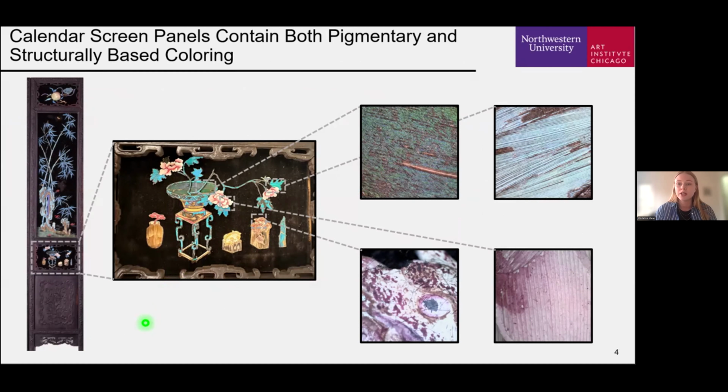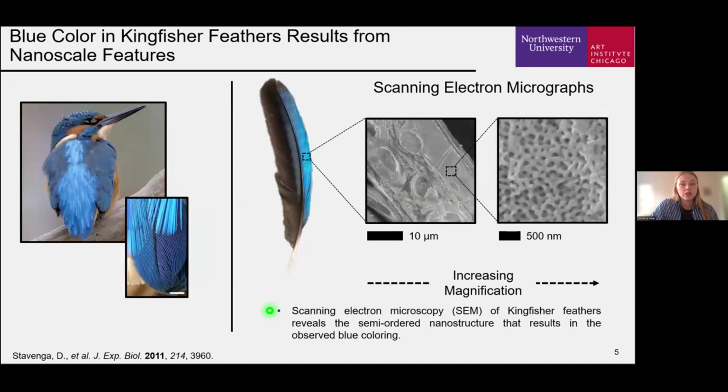This series of panels was of great interest to us, in part because of its size, as most examples of chongchui consist of smaller hairpins and jewelry, but also because of the combined usage of structurally and pigmentary-based colorants, as highlighted by the top for structural and the bottom micrograph inset, respectively. Structurally based colorants can be found throughout cultural heritage, although less common than dyes and pigments, but have been historically understudied because of challenges related to differing mechanisms of coloration and angular variability in structural coloring that, when combined with the three-dimensional nature of these objects, makes for a very complex research process.